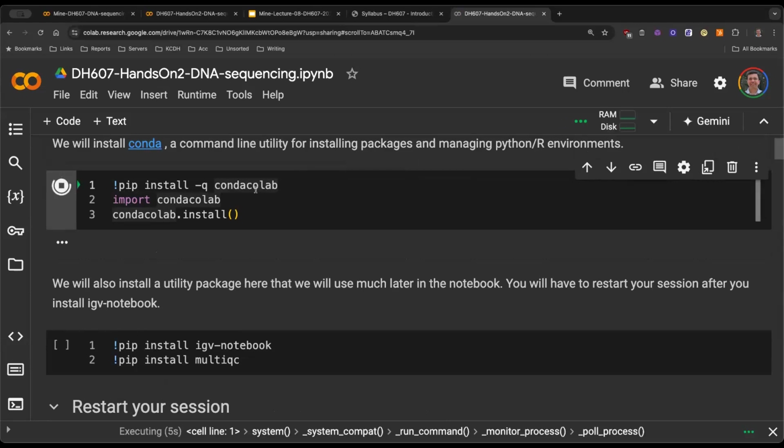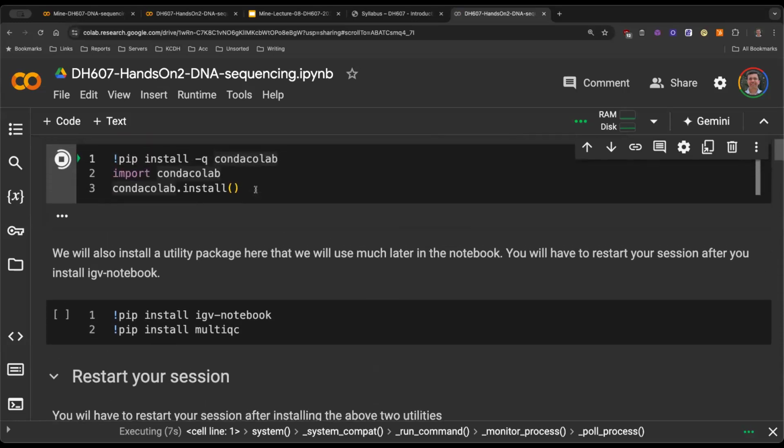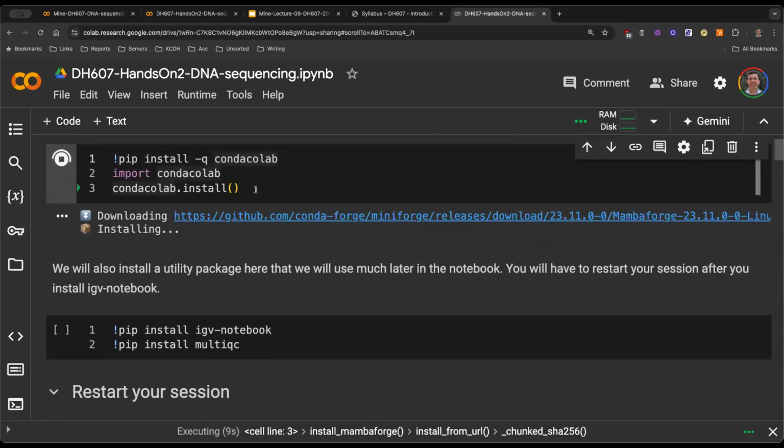I'll do the first two steps, and then I'll let you wander in this notebook and figure out what you see in the end. Okay. Everyone with me so far?